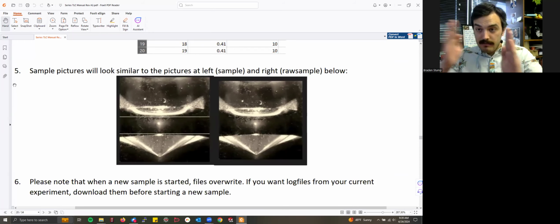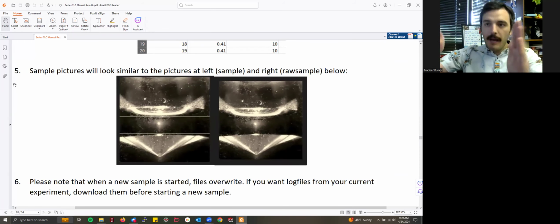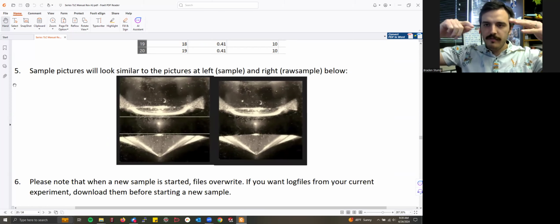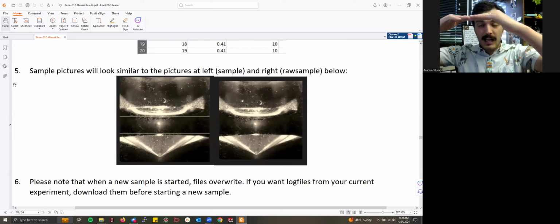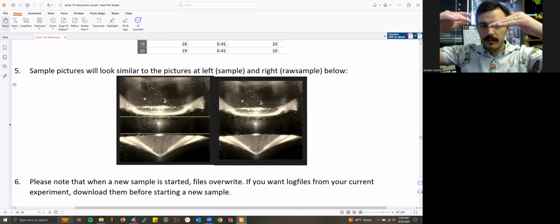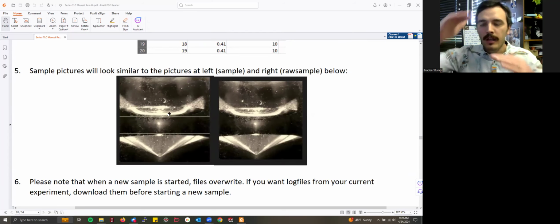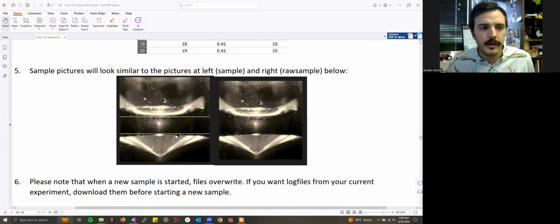The way that it does it is after 5 minutes of sampling, it stops the pump for a few seconds, takes that picture of the liquid level, uses machine vision to determine, is this higher than or lower than the starting liquid volume picture that I took? And if it is too low, moderator temperature is increased. If it is too high, moderator temperature is decreased. So effectively, there's this direct correlation between what you want to see happen in the vial and your moderator temperature because you're holding your sample temperature static.